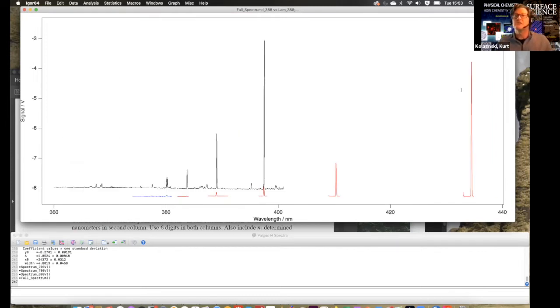You can see here originally is the intensity pattern, this dropping off. So we can definitely line these peaks up. We know those are good. And if we continue the intensity pattern, all right, so these are good peaks. Here's a good peak, right? Which at 1,000 volts, we clearly get, whereas when we looked at this at only 700 volts, we were starting to lose that and we didn't know what was going on.